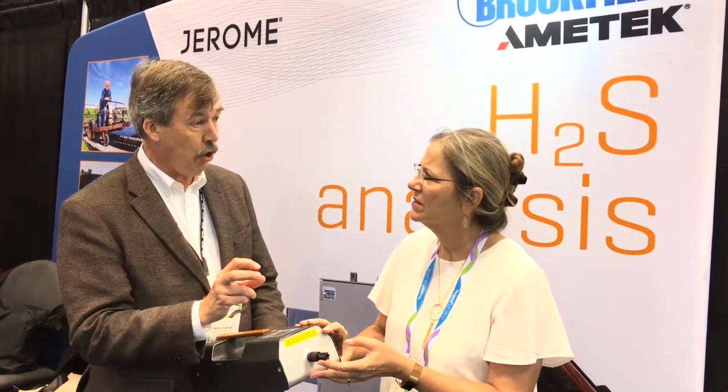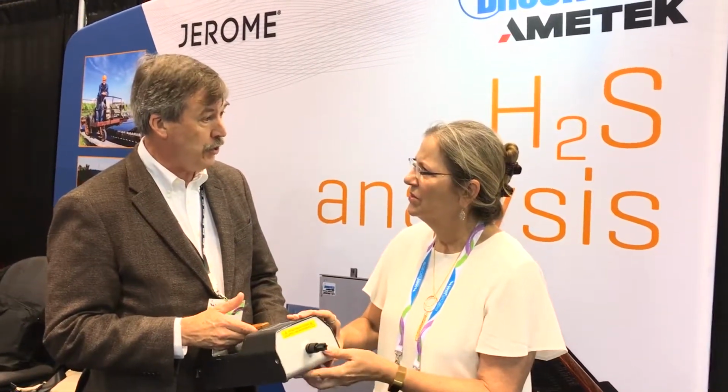All right, let's do it. Thanks, Sharon, this is one of my favorite toys. Look at it, it's worn, but it is a classic. It's a Jerome 631X. Doesn't that sound like a spaceship or something? Well, this is fantastic. How does it work? It's gold film technology. The sulfur comes in, the ion attaches to the gold film, it changes the resistance across the gold film, and that, with the flow rate, tells you what your sulfide concentrations are.